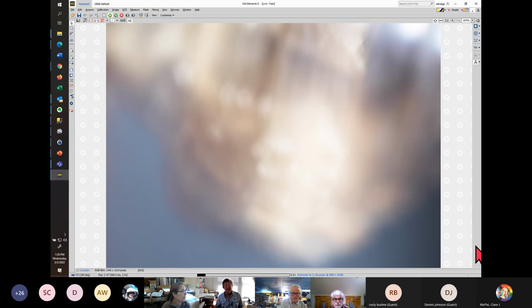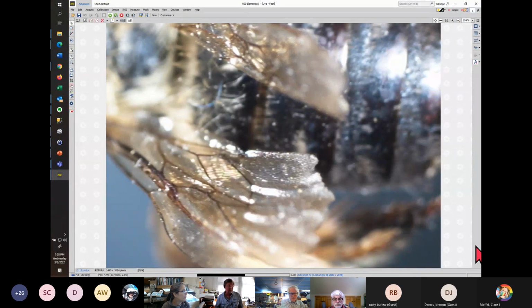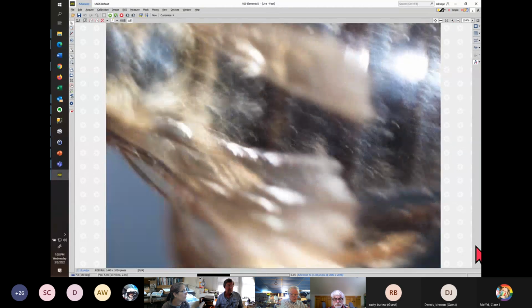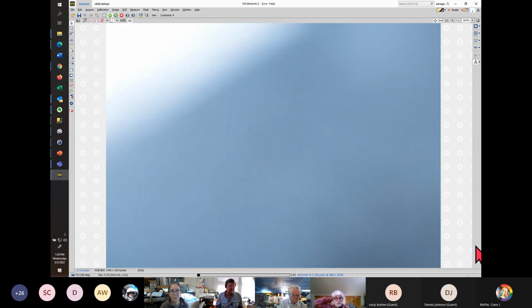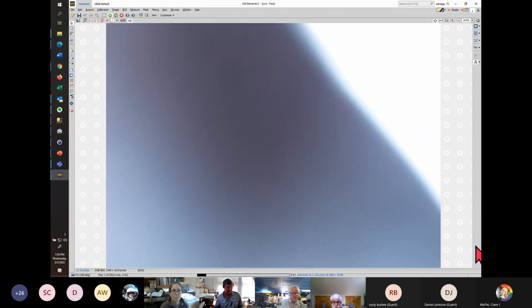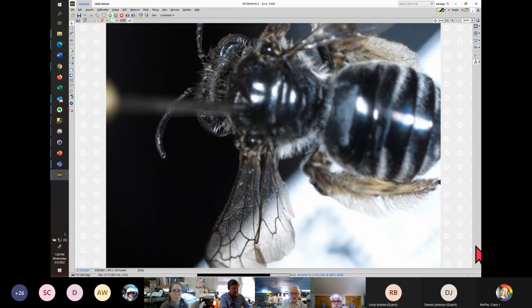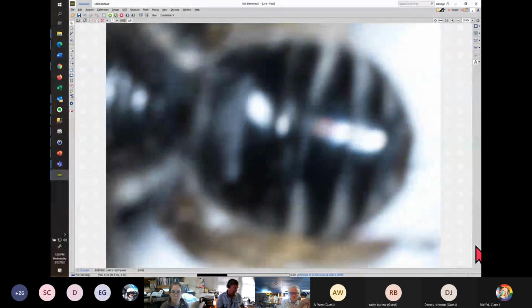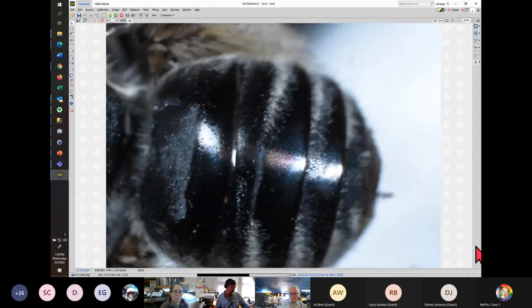So I'm pulling up, to contrast, I'm pulling up denticulatus for 2 reasons. One is just to show specimens that have, trying to get the bare area on the back. Right. Oh, here we go. So you can see this contrasting specimen with a very wide bare area, in contrast to what we were just looking at.